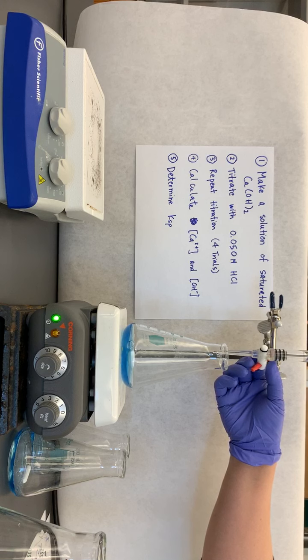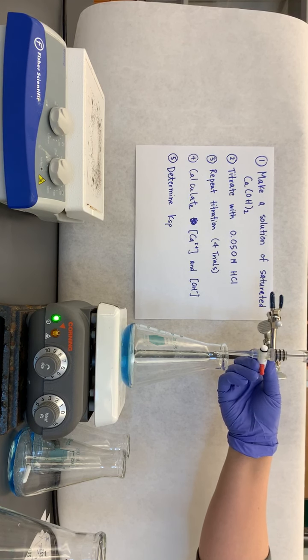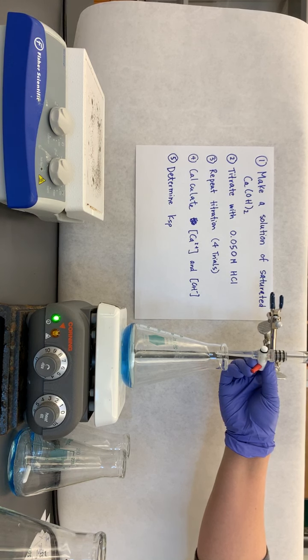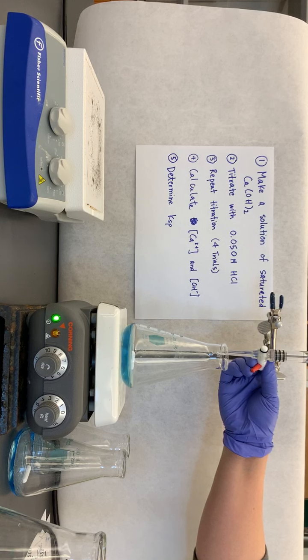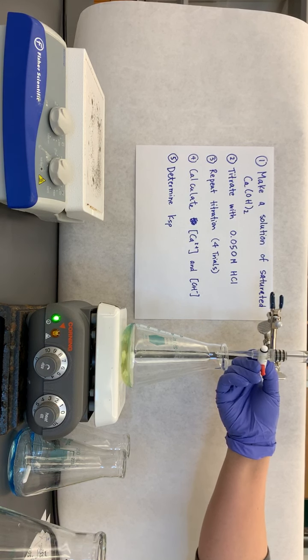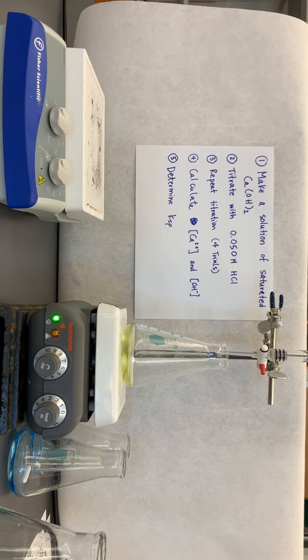Normally when I do a titration, I don't add it this quickly, but I'm trying to save a little bit of time, so we're just going to go ahead and almost there. Okay, that looks good. Okay, and again, you can see it's a yellow color.